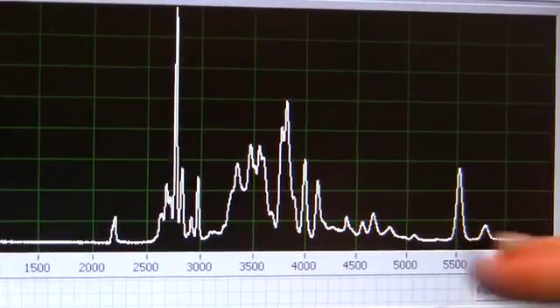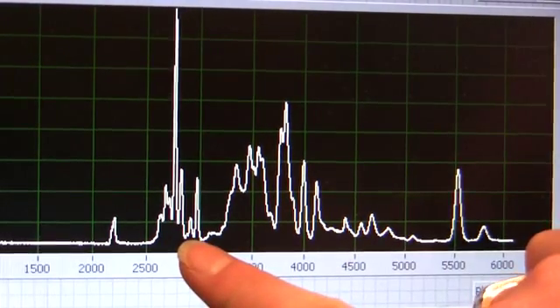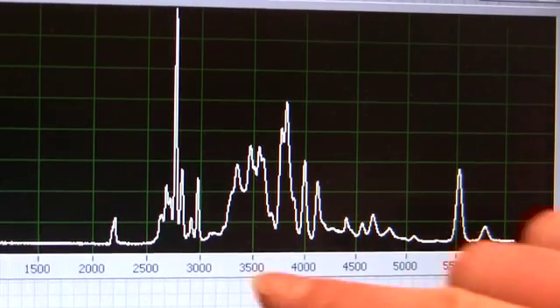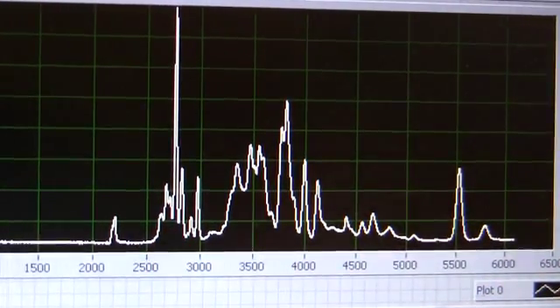These peaks are aspartic acid and glutamic acid, which are important amino acids for nutrition. This peak is tyramine, which is responsible for a hypertensive response and a headache that you get after drinking wine. This peak is histamine, which causes an allergic response and is also responsible for hypertension.